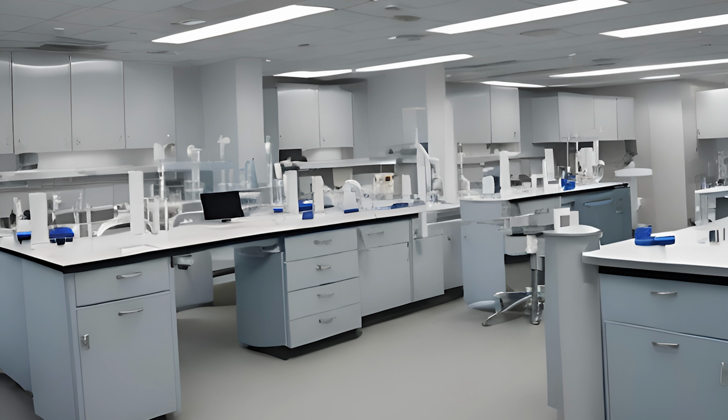CAP requires that your lab has a documented tuberculosis control plan. It conforms to biosafety guidelines published by the CDC. The purpose of this plan is to prevent the transmission of tuberculosis, also known as TB. Tuberculosis isn't that common in the United States, but if you leave the US, it becomes very common in the rest of the world. It is massively prevalent in other countries.